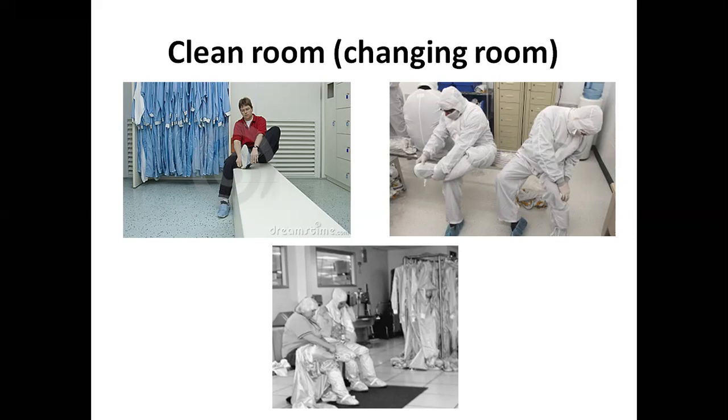For each process, there is a standard procedure. If you are violating that procedure, then that manager would alarm you. He would call you and inform you that you have to use the standard procedure, SOP. You have to follow the SOP.